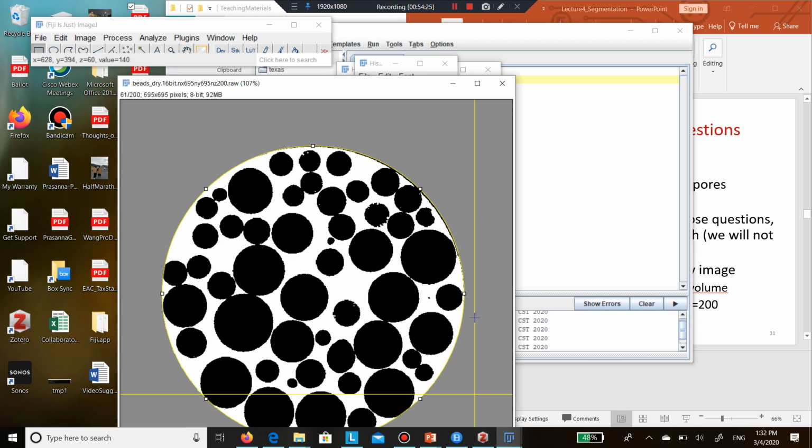Well, I can calculate what the volume of the cylinder is. I drew it, so I know what the cylinder is. I can sum up black and white values because these are ignored. There are multiple ways, but it also depends on the choices you make in these procedures: how is the outside labeled, is it counted in your histogram, so be sensitive to that. In this case, the way I did it, yes, you can. However, if this background was white or black and counted in the histogram, then no.